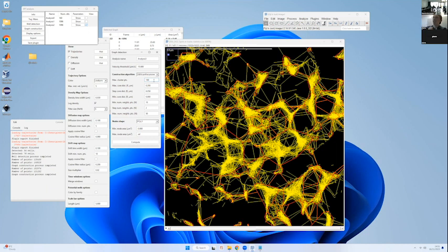And it will do that recursively until all the clusters are below the threshold you specified, or it exhausts its parameters. So it's a simple application of multiple dbScans with your big cluster.